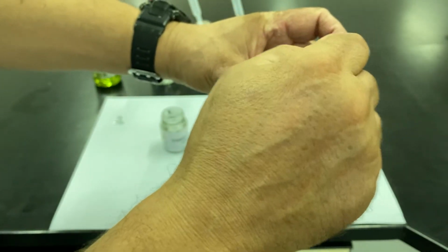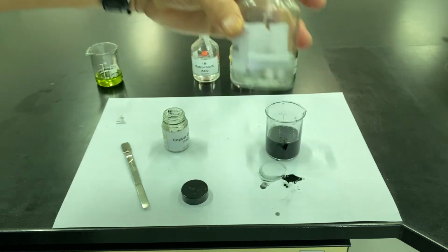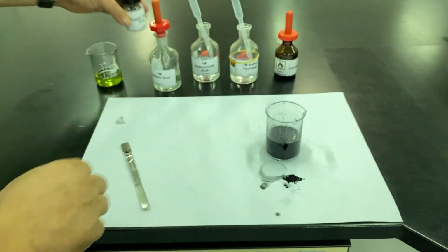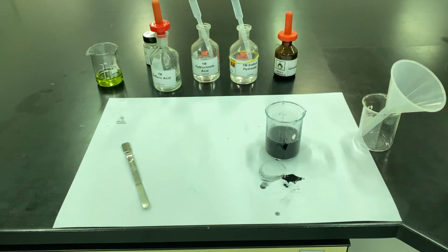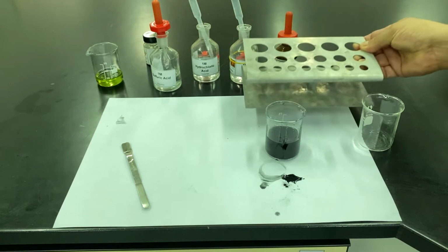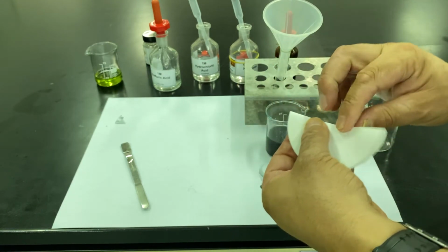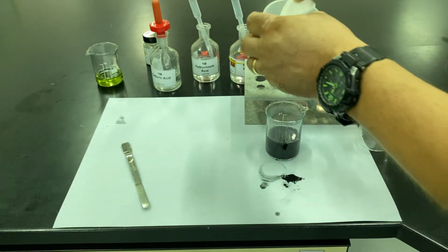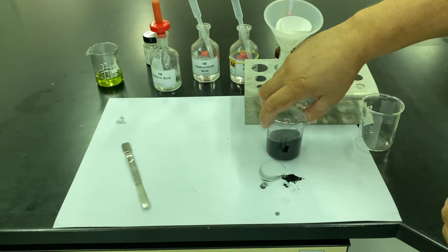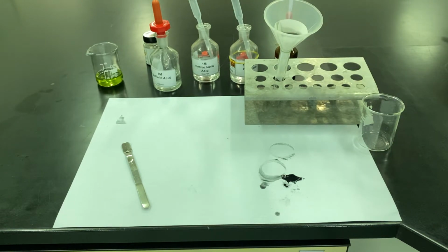Now if I filter this, okay, what colour is the sulfuric acid? So the sulfuric acid is colourless. But if I filter this with a filter funnel into a test tube and filter paper, okay, I'm after the solution that's being produced here. More importantly, I'm after what colour it is.